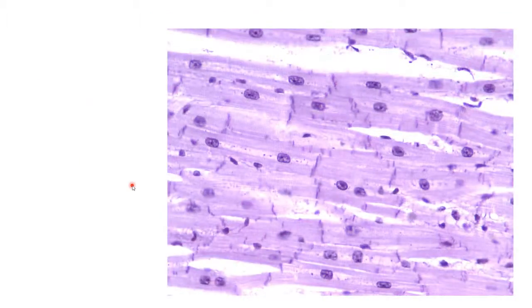Here's another version of my cardiac muscle tissue slide. This one, it's a little bit harder to see those striations, though there are some places where you can see them. But on this one, you can really see those intercalated discs really well. See those dark lines that I find all over the place?